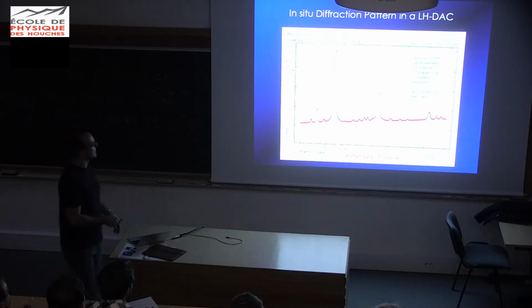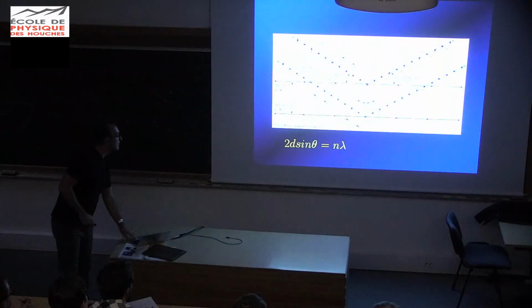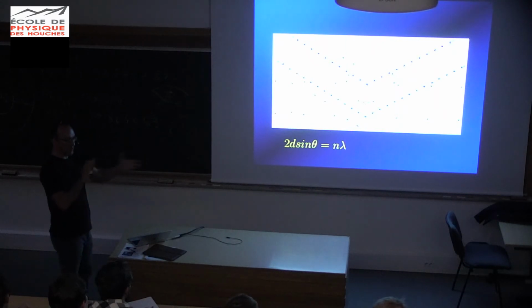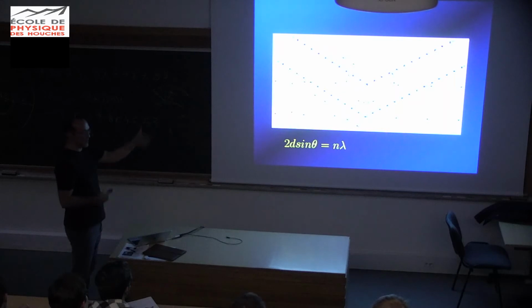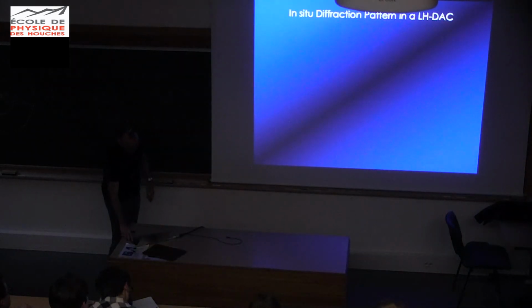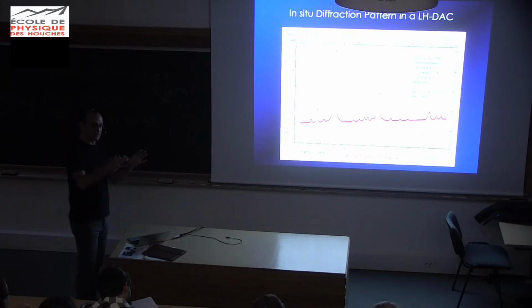Just don't ask why. Basically, you have a peak, where each peak corresponds to a certain d-spacing in your sample, okay? So this is a periodic d-spacing, so it's measurable. Then there's this one, then there's this one, then there's the third diagonal, and it's in 3D. So you can imagine all the combinations; it has to be periodic to give constructive interferences. But you can measure all of those distances, and once you get all of them, you can work out the size of the lattice of your crystals.